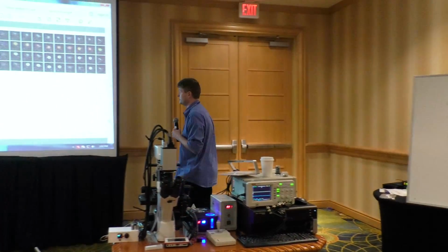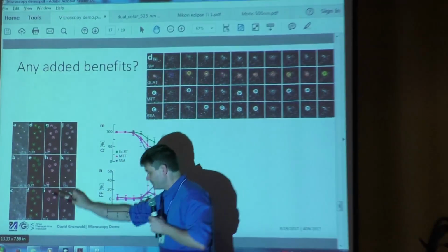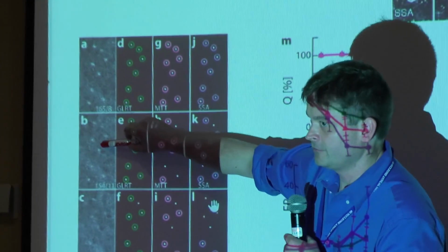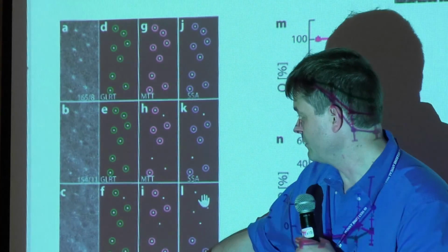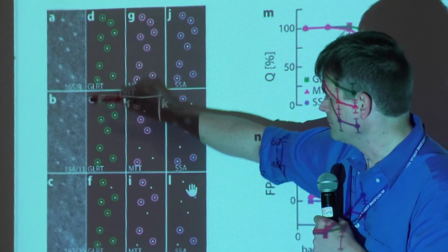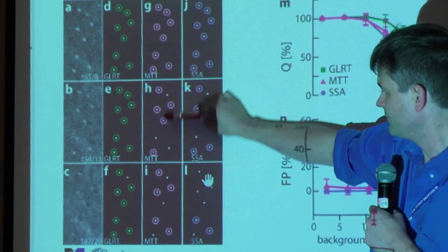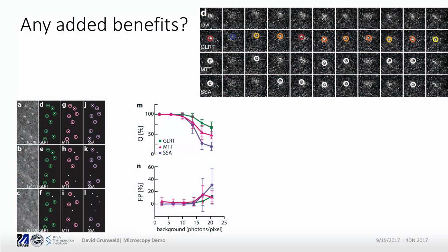Down here, just as another example of why this is a good idea for FISH. Well, if you look at these images, these are beads. And what we did is we used a white light laser and just produced noise. And the question is, which method finds how many of the particles and how many right and wrong? Well, you basically see there are differences. There are differences that in one case is defined. In the other case, we need to squeeze the methods to basically work within a certain performance interval.